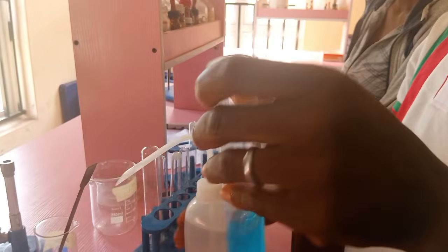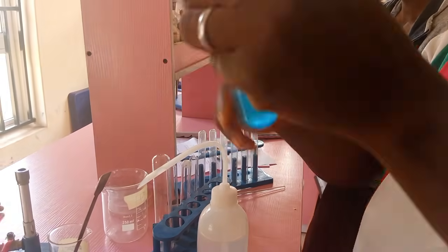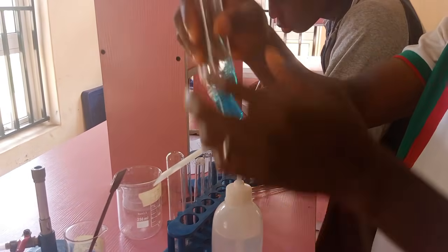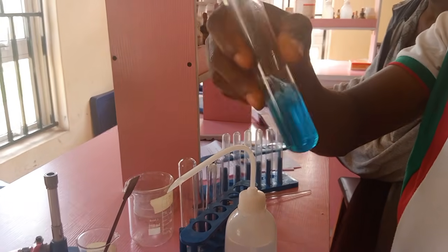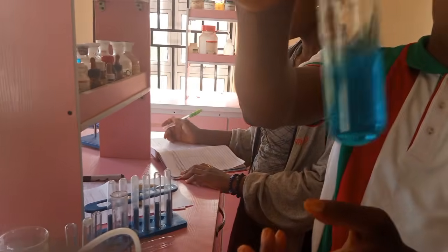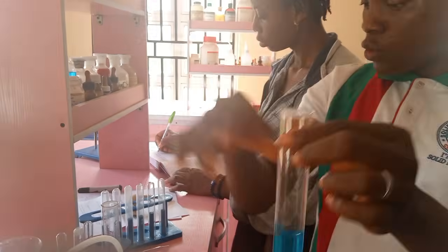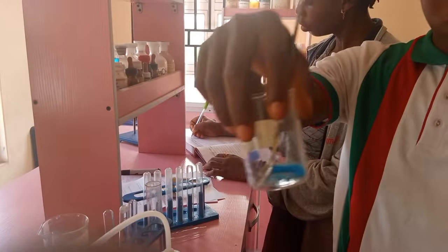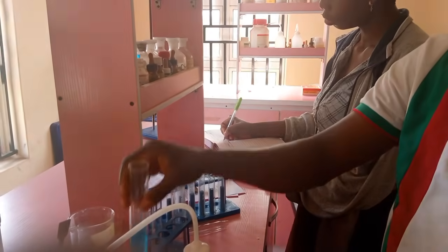Now keep stirring. It's a soluble salt, so everything is supposed to be soluble. It's going to dissolve with time. You can see it's very soluble. So what we have here is a pale blue solution. The salt C, which is copper(II) tetraoxosulfate(VI), is soluble in water. Are you following me? Yes, it's soluble in water.